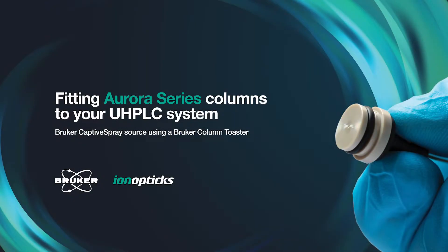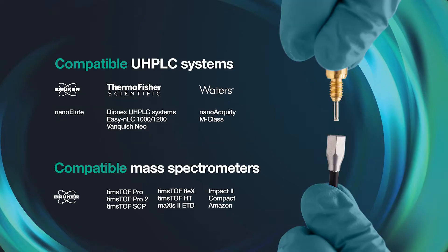This video demonstrates how to fit an Aurora series column to your UHPLC system for a Bruker captive spray source using a Bruker column heater. The following LC-MS platform technologies are compatible with this video. Please refer to our user guide for recommended configurations for each UHPLC system.